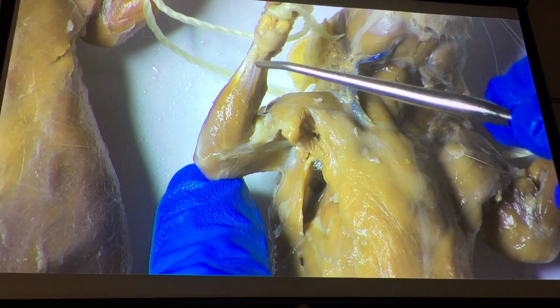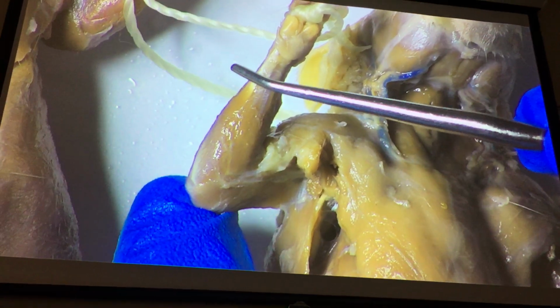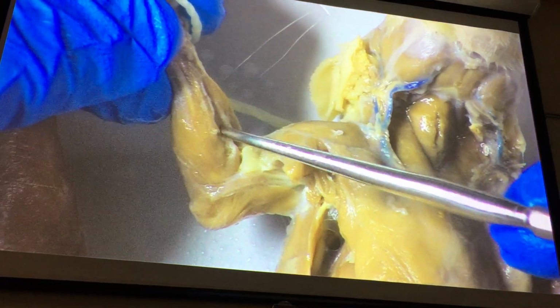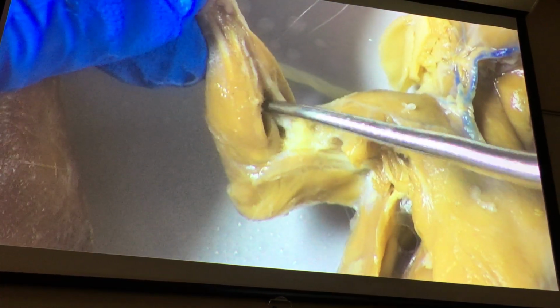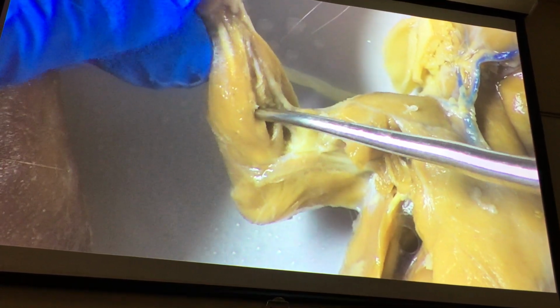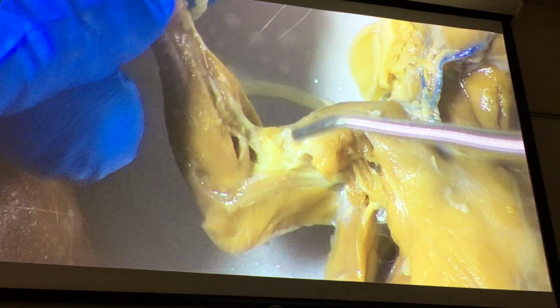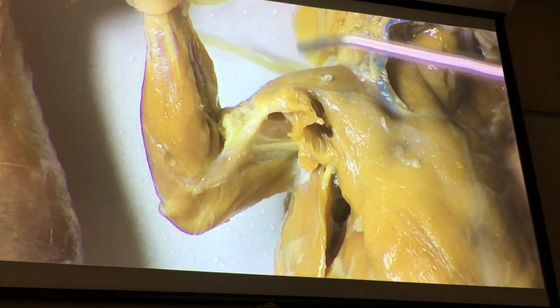And then getting on to the forearm, right? Now with the forearm, ventral forearm, all are flexors or pronators. It's going to go PF, PF. Our first muscle, see if I can do this without blocking the view, is a fairly short muscle. It doesn't run the full length, it doesn't have to. That's the pronator teres. Then we get our flexor carpi radialis, because we're on the radial side, palmaris longus, flexor carpi ulnaris. Okay? And then of course this little muscle in here that kind of still carved out a little bit of fascia. Let's see if this one shows it better.